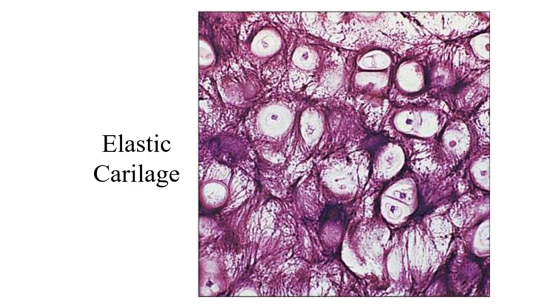Elastic cartilage, going into our cartilages, has elastic fibers. And so all of these little fibers interspersed through here, going all kinds of different directions, all those fibers are elastic fibers. Very, very stretchy, very, very resilient. So all those dark purple spaces inside there are the elastic fibers themselves. And so we can stretch it, we can pull it, and it bounces right back to its normal position.